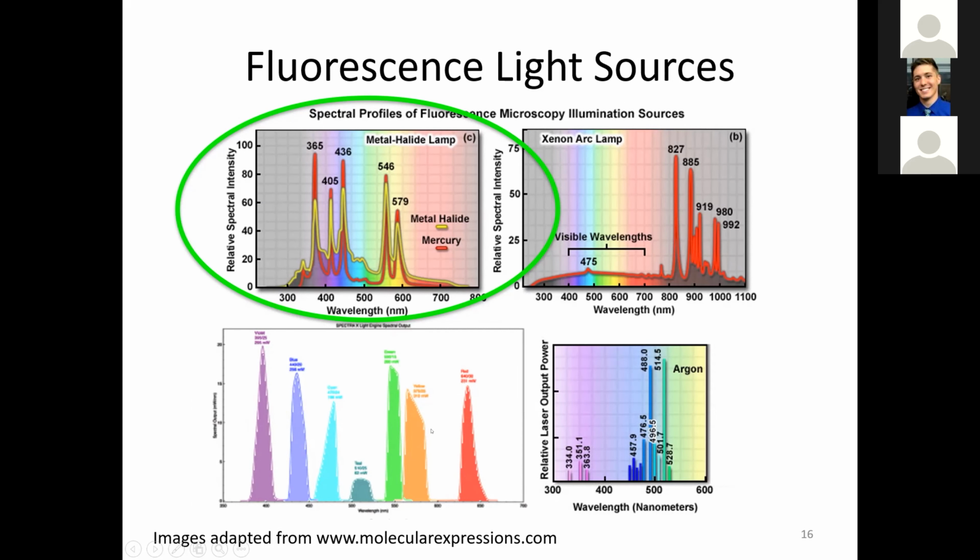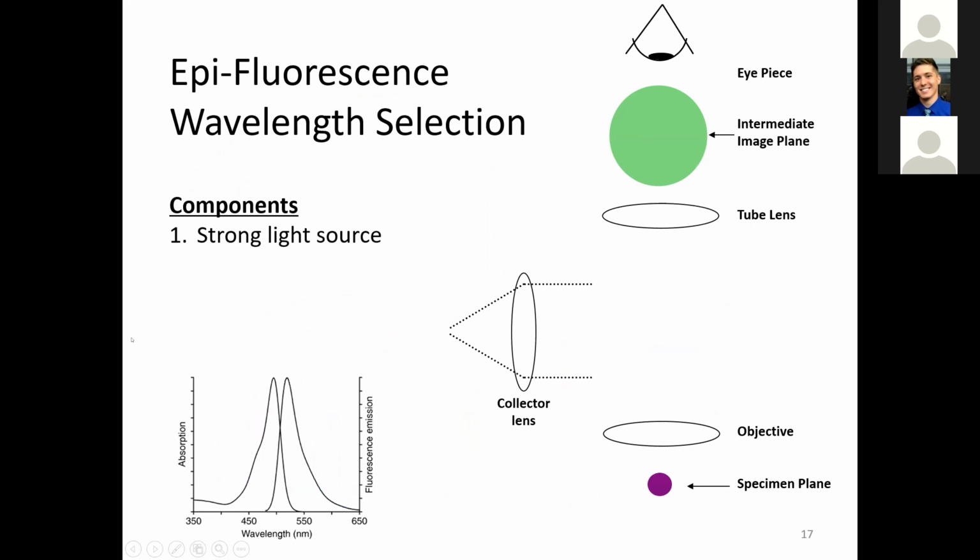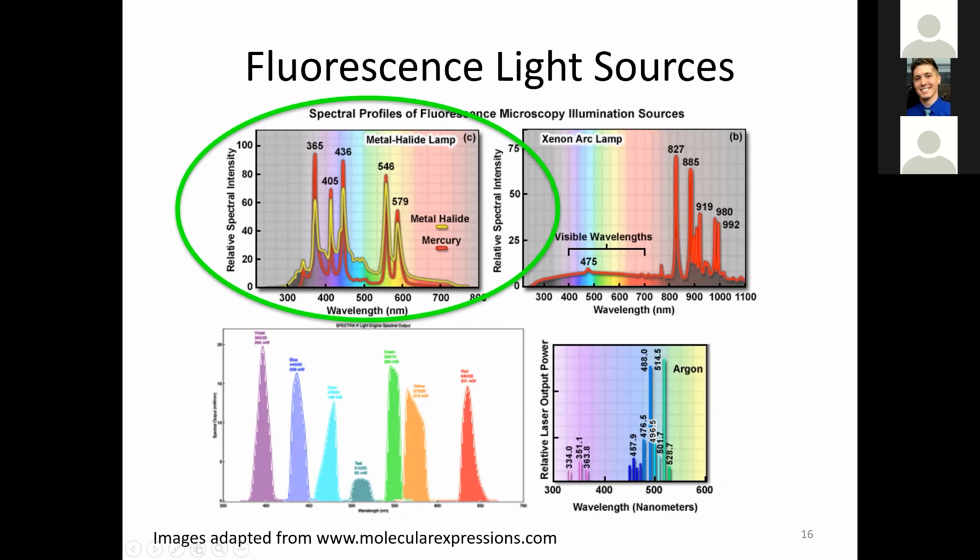While they're a little bit more consistent than, say, the metal halide or the xenon arc lamp, it's still not straight across the board. And lasers suffer similar problems as well. When we say we're imaging at 0.5%, is that 0.5% the same in actual concentration of photons across the board?